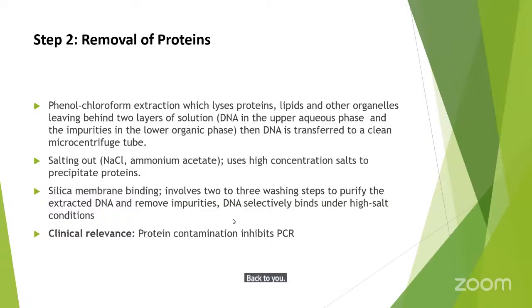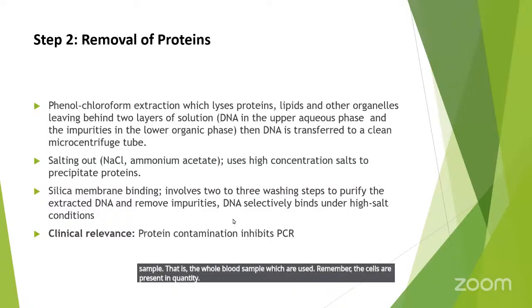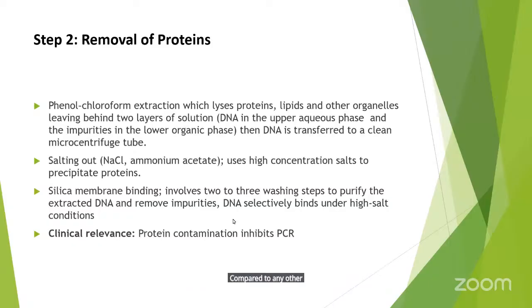The reason why the sample affects the method of choice, I can say, for example, in the whole blood sample, remember, the cells are present in quantity compared to any other specimen, like for example the sputum.